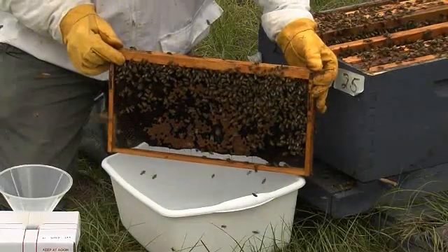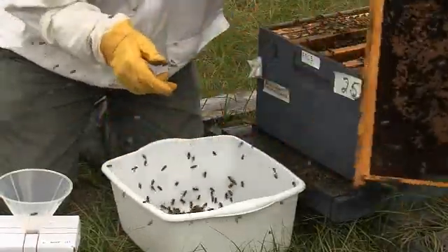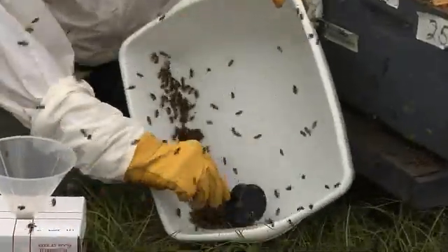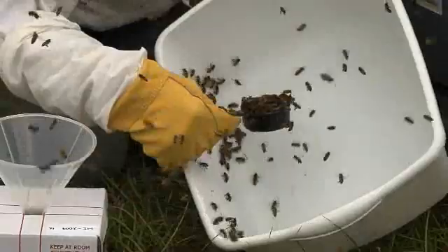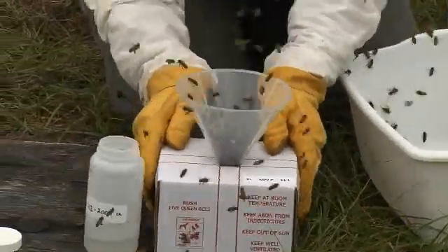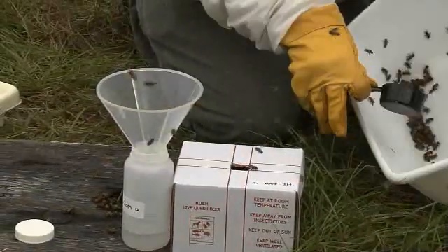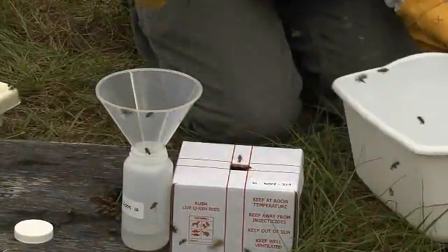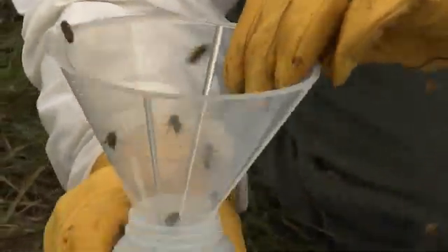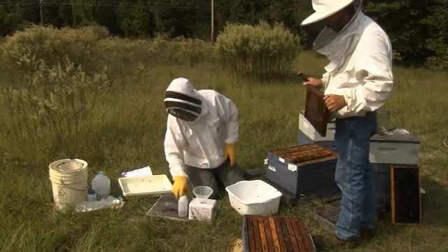Shake bees vigorously from the frames into the washtub. Bump the washtub to gather bees into one corner of the tub. Scoop one quarter cup of adult bees into the funnel inserted into the lid of the live bee shipping box, then gently tap the box to force the bees from the funnel into the box. Scoop a second quarter cup of bees from the tub into the funnel that is now inserted into the large bottle containing alcohol. Tap the bottle and funnel to force the bees into the bottle.